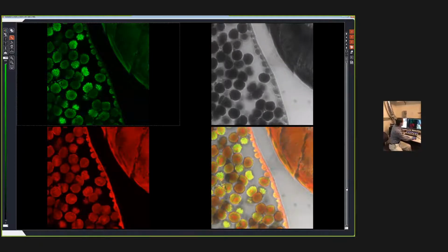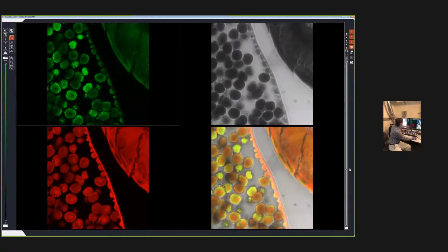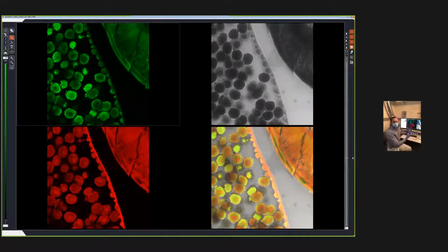You can also see that we have two components in these organ systems: in the red color, we have open spaces, and in the green, we have bright circles filling those spaces. So we've successfully separated two different biological components by the utilization of color. That's a big advantage in light microscopy: most things are transparent to light, and we're able to separate the components by color, helping us dissect the biological components that we care about from the things that we either want to compare to or don't want to see.